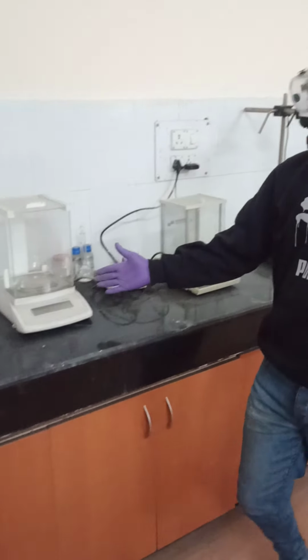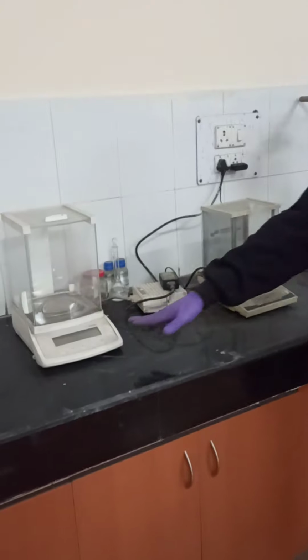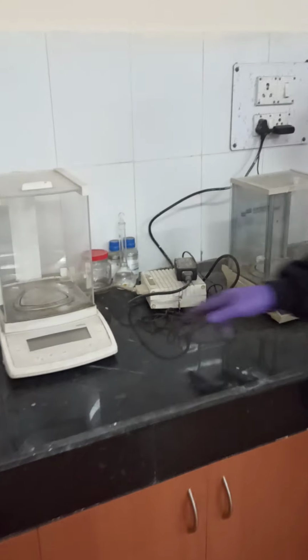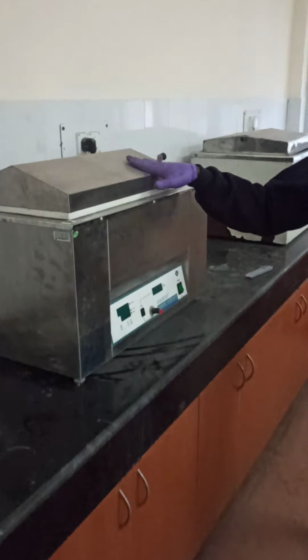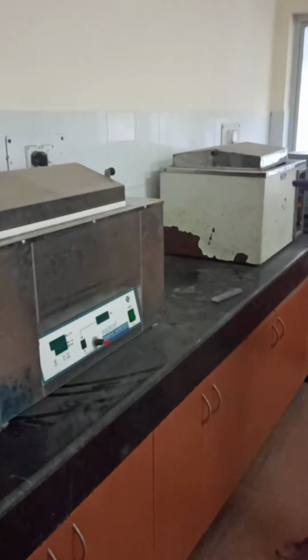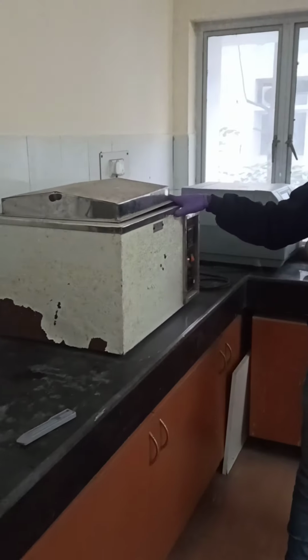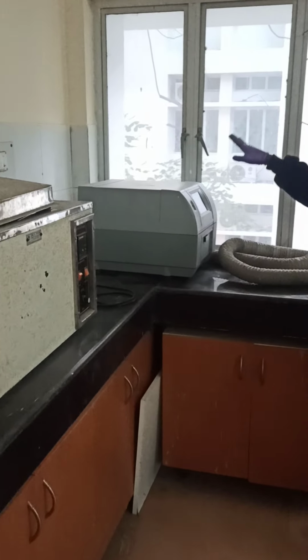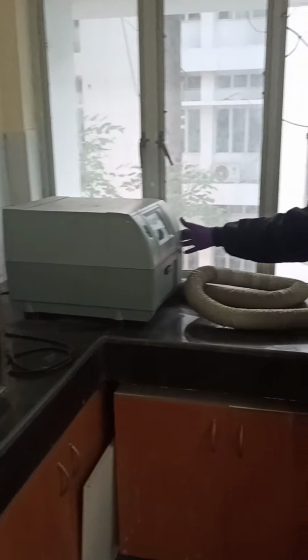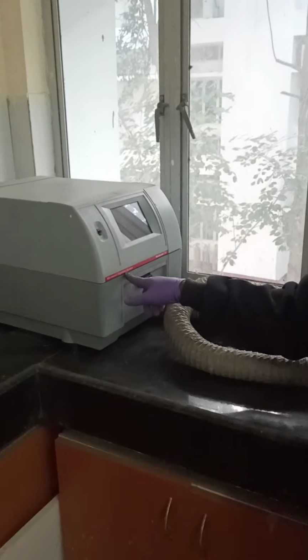On the other side, I'm having the weighing balances. They are here, with different accuracy. This is 0.1 accuracy. This is 0.001 accuracy. I am having the water shaker in my labs. I am having a water bath in my labs, which is very important. Good enough. This is what we call the microwave digester system.